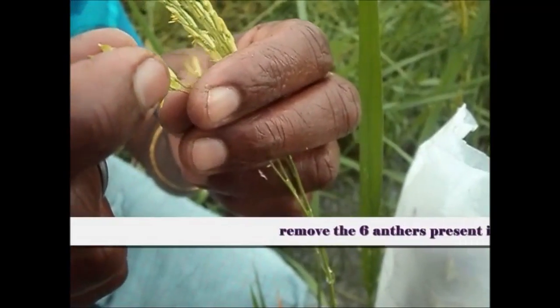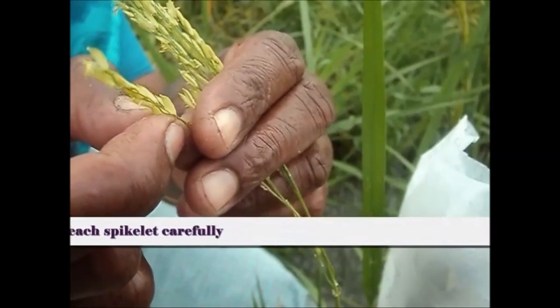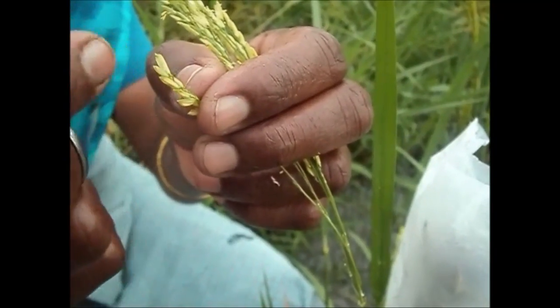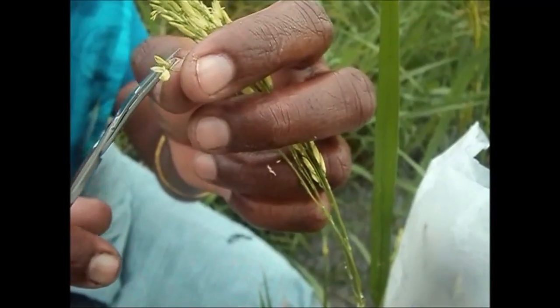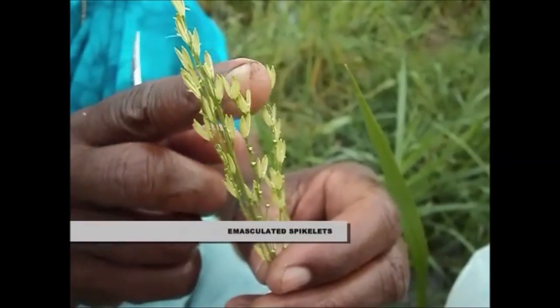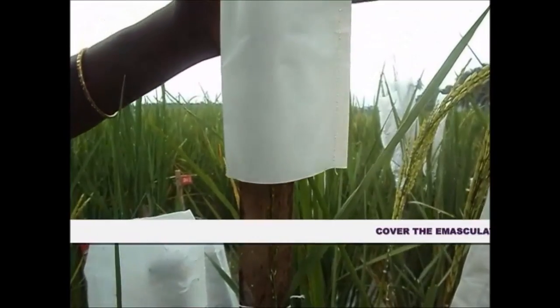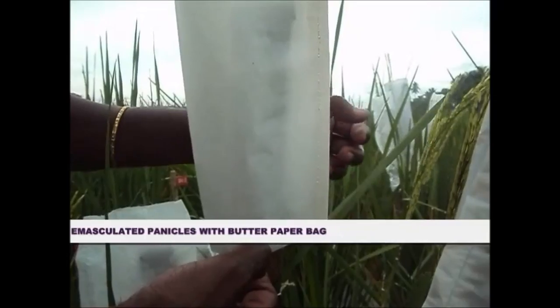Remove the six anthers present in each spikelet carefully. Hand emasculation method is used — it is the process of removal of anthers with the help of forceps. These are the emasculated spikelets. To avoid contamination from foreign pollen, the spikelets are covered with a butter paper bag.